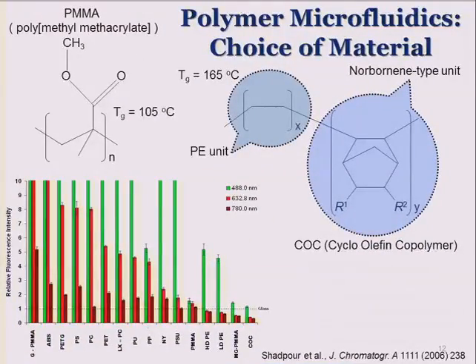So here are some materials. These are common ones. This is, and Claudia showed this, cycloolefin copolymer. It's a copolymer. That's really interesting because with copolymers, you can change the monomer composition to change its physiochemical properties. Refractive index, Tg, you can fine-tune all that.